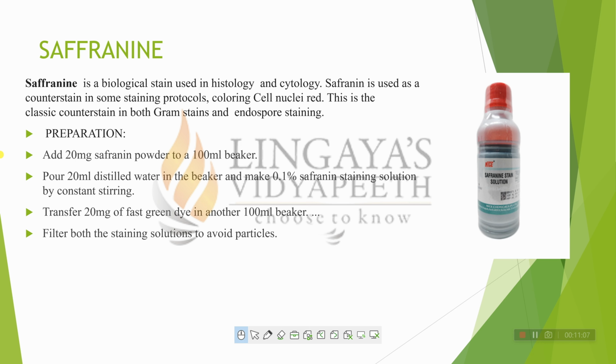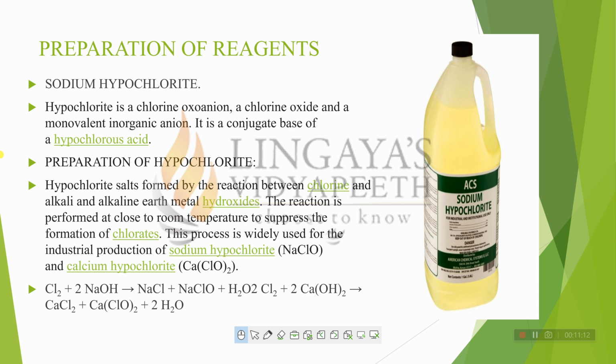You have to filter the staining solution to avoid particles. This is how this safranin solution is prepared. Now talking about the sodium hypochlorite.